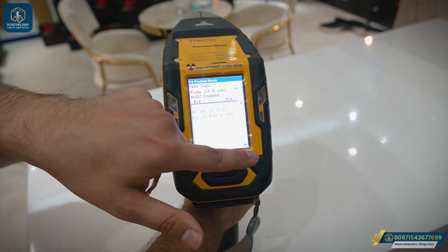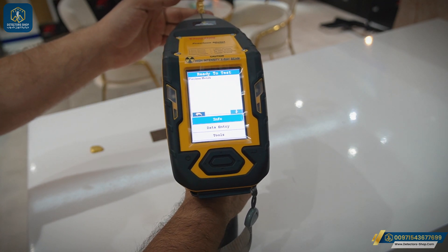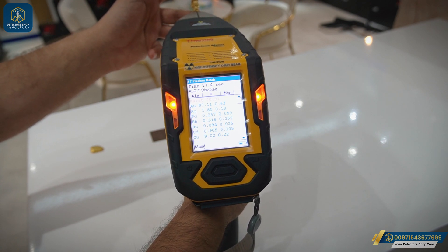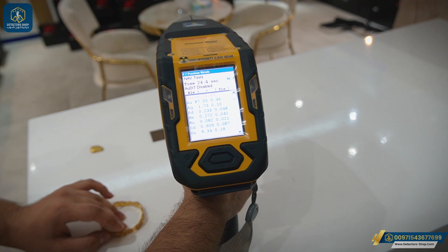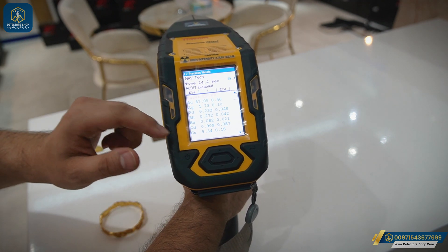We'll go back and press the trigger for 20 seconds. After finishing the experiment, we have a carat of 20.89, along with readings for the other elements present.